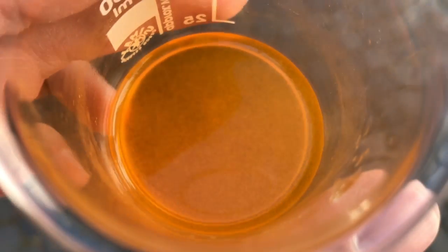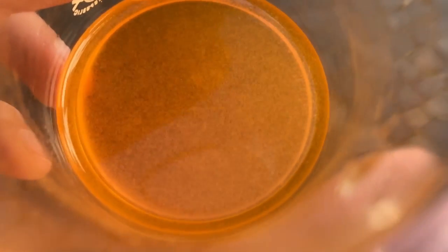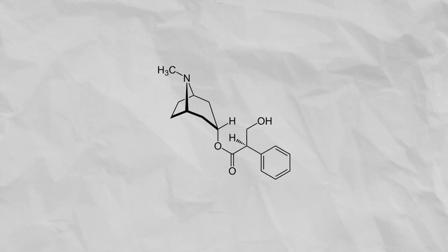There are small specks in the solution and this confirms that the test was positive and that we indeed dealt with an alkaloid.